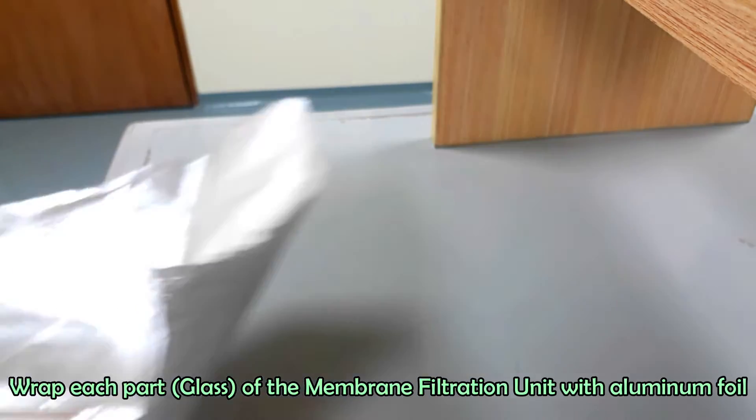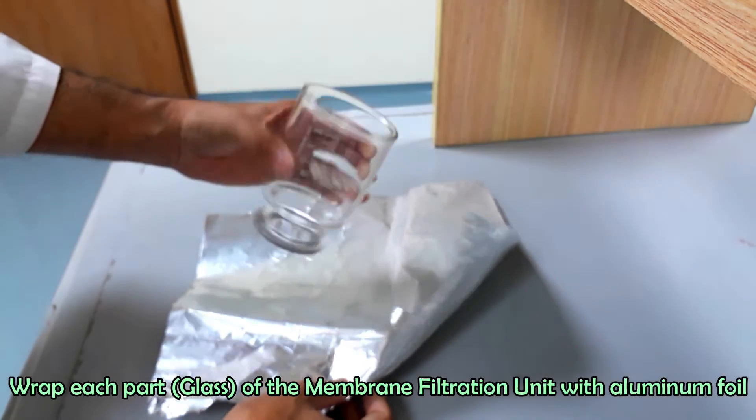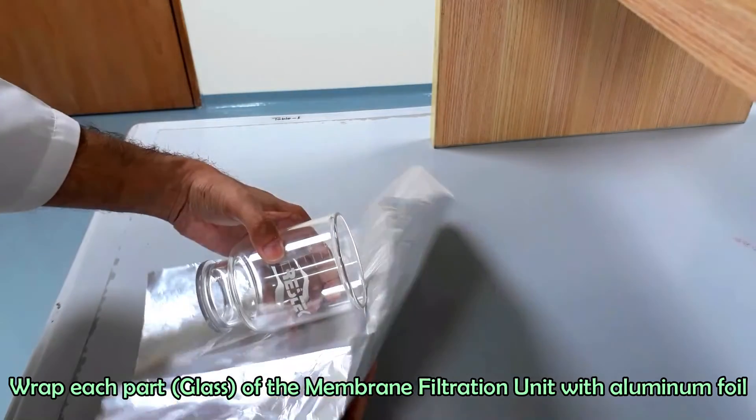Now we will make the filtration unit ready. Enclose each part of the filtration unit with aluminum foil paper and autoclave to sterilize.